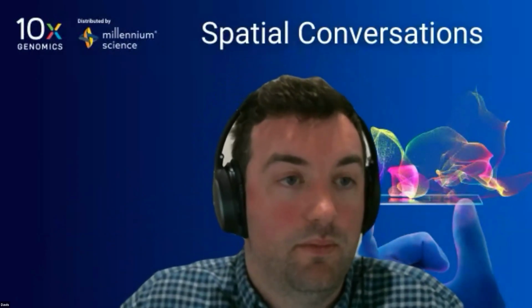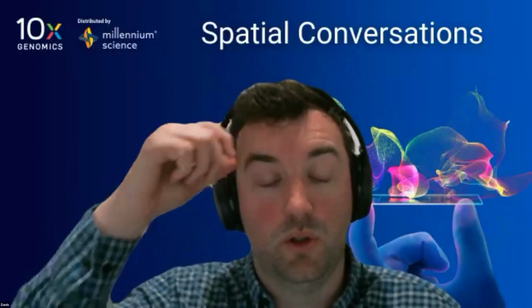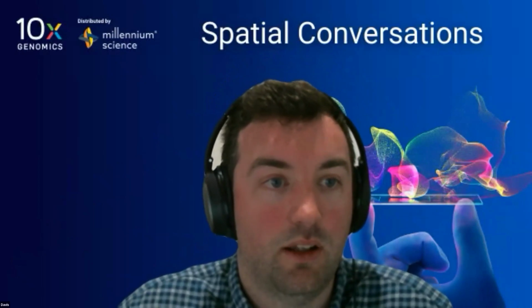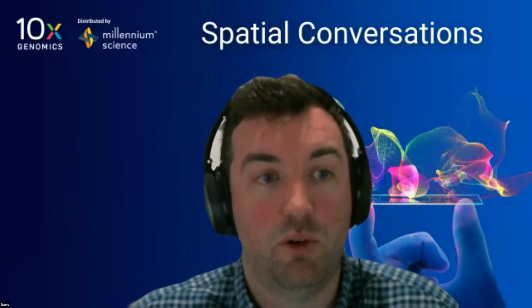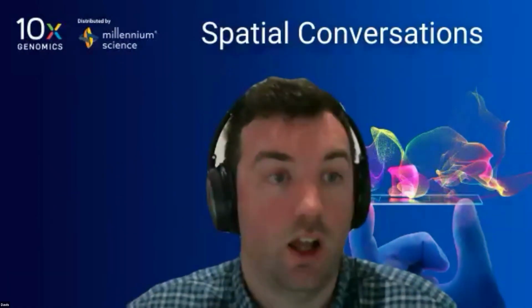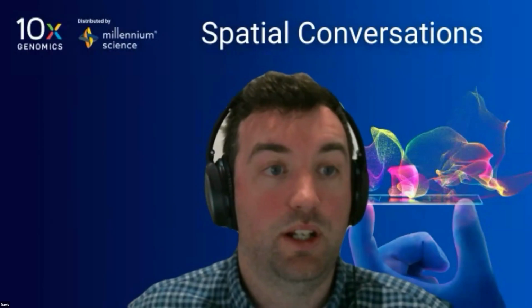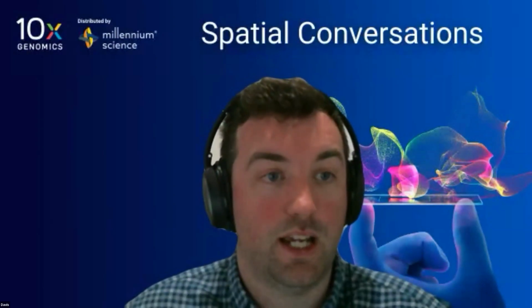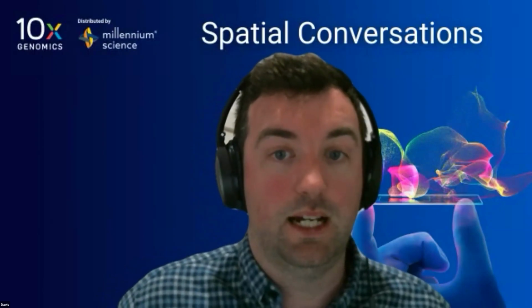We did some investigation, some trial and error, to decide on the hyperparameters that we used. Like a lot of analysis approaches everywhere in omics, there are a lot of user degrees of freedom. There are a lot of points in analysis where you need to make a choice, apply your best judgment, and do what investigations you can to decide what to do. So that's essentially what we did here.